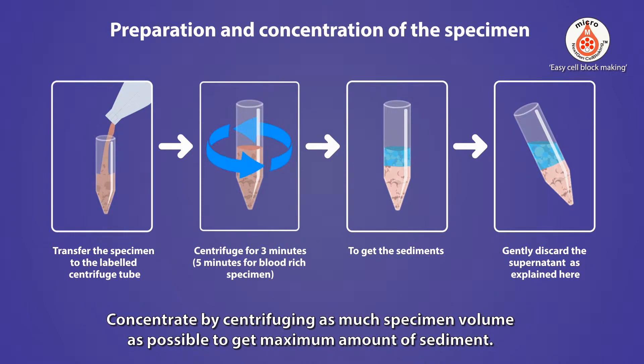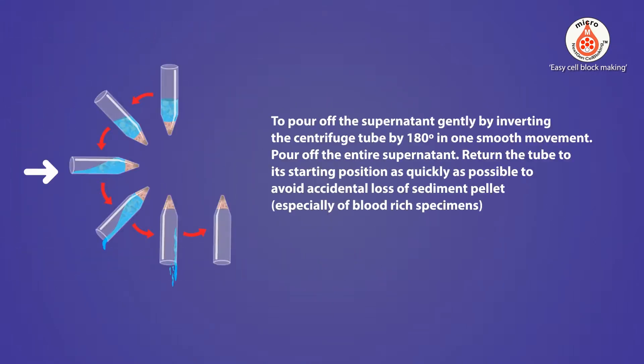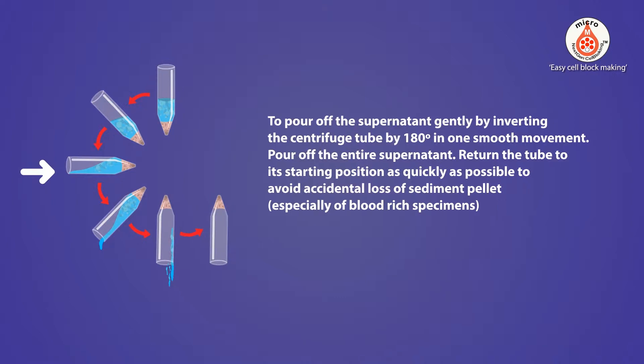Concentrate by centrifuging as much specimen volume as possible to get the maximum amount of sediment. Pour off the supernatant gently by inverting the centrifuge tube 180 degrees in one smooth movement, pouring off the entire supernatant. Return the tube to its starting position as quickly as possible to avoid accidental loss of sediment pellet, especially with blood-rich specimens.